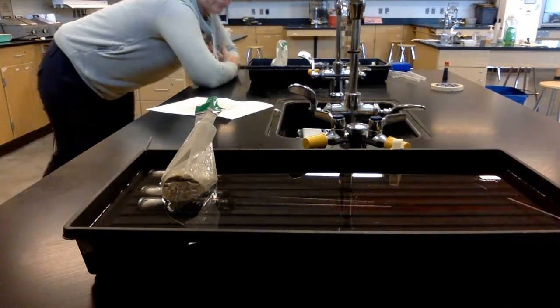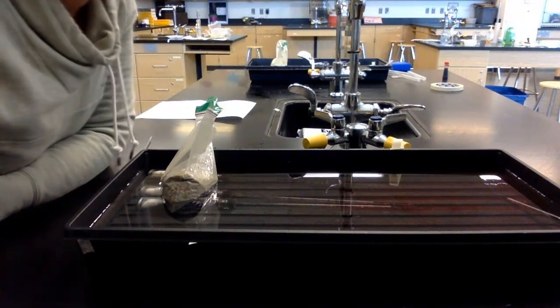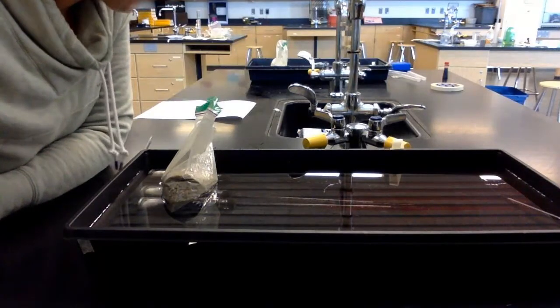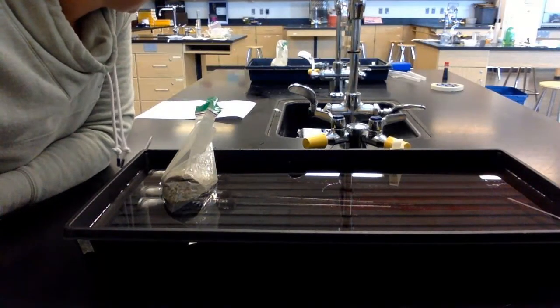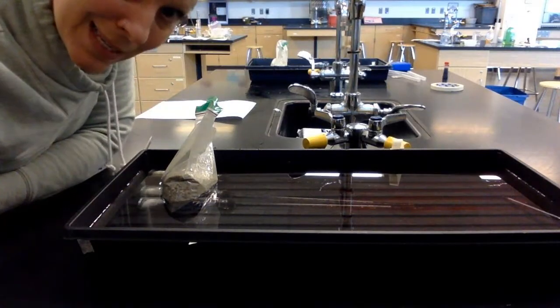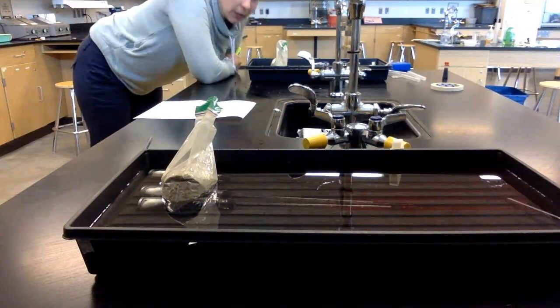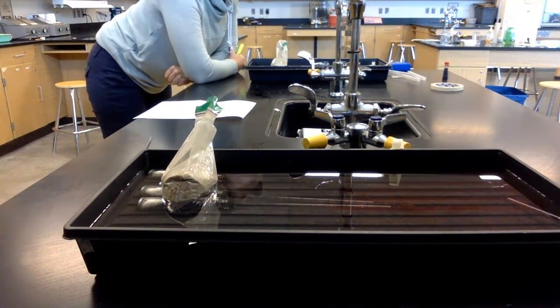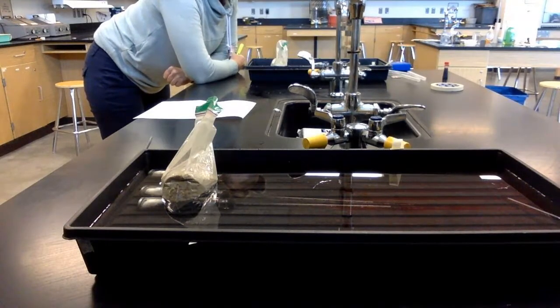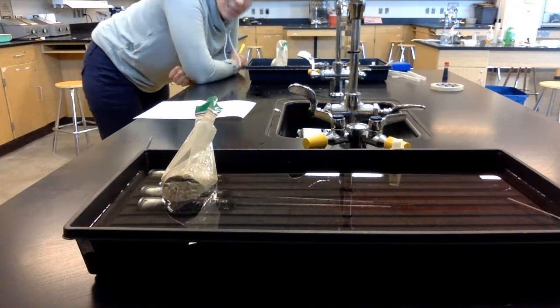At minute 15: respirometer one is 0.71. Respirometer two is 0.86. Respirometer three is 0.90. Respirometer four is 0.83. Respirometer five is 0.86. Respirometer six is 0.92.